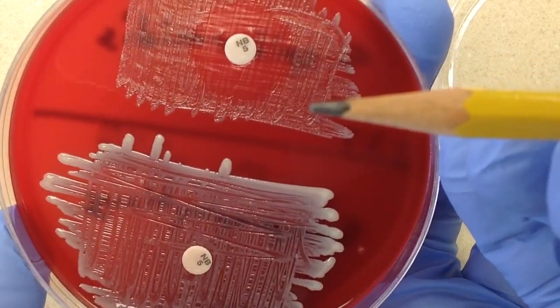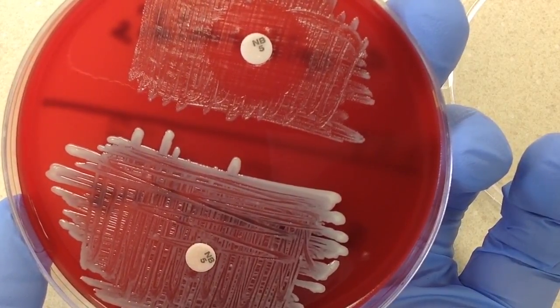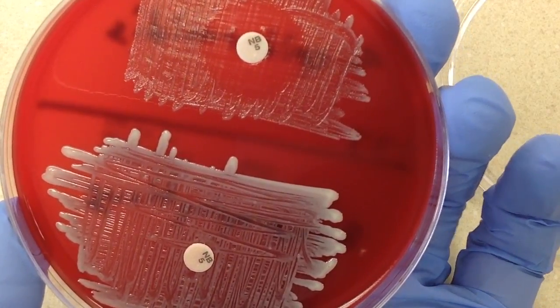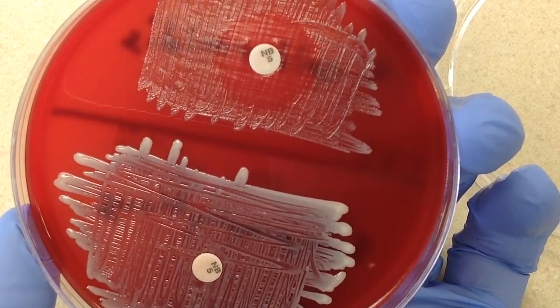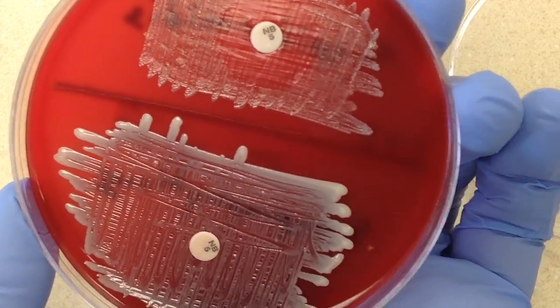With the Novobiocin test, it comes down to measuring the zone of susceptibility, and it needs to be at least 17 millimeters to be considered sensitive or susceptible. Anything less than that will be considered resistant. So we can see here, obviously, our Staph saprophyticus on the bottom is completely resistant.